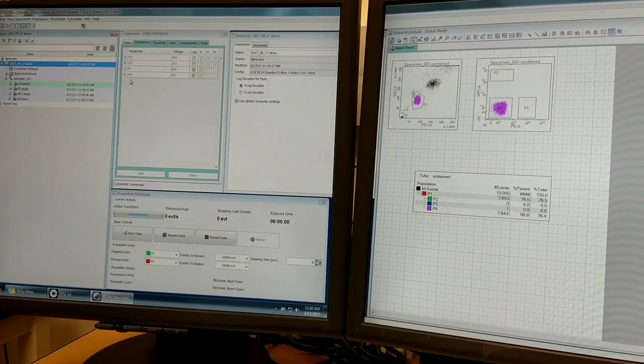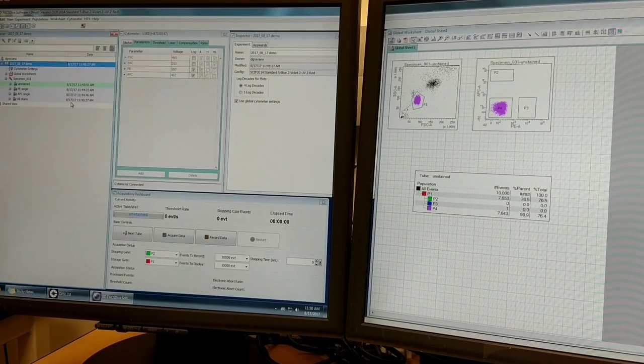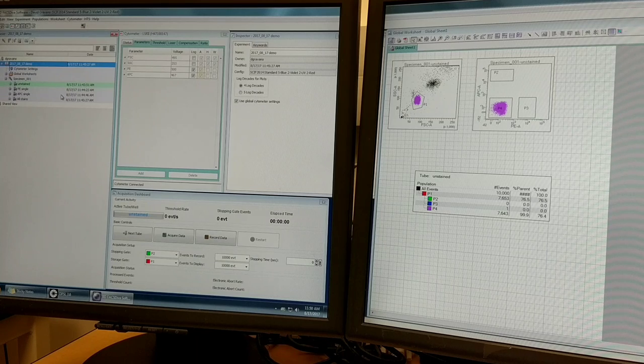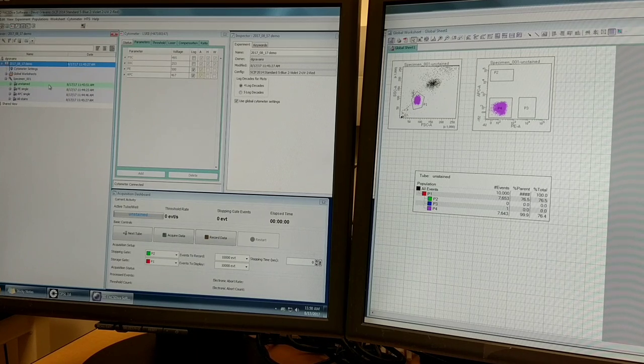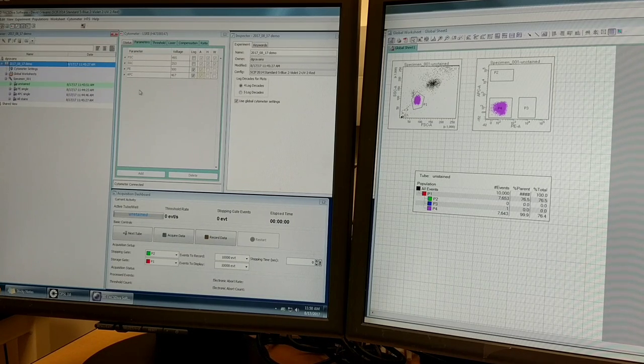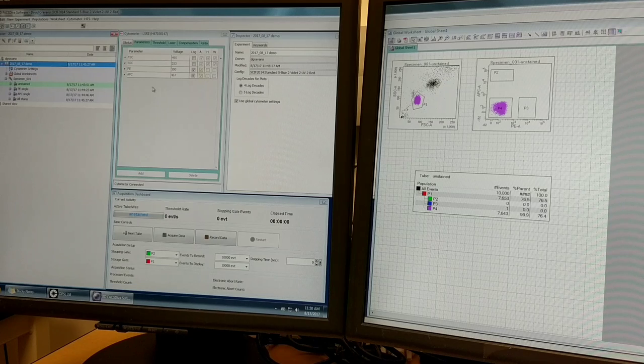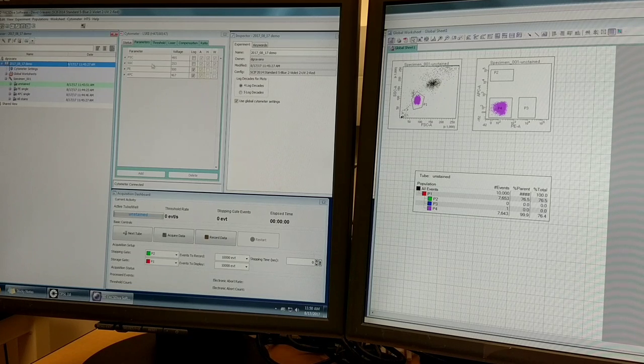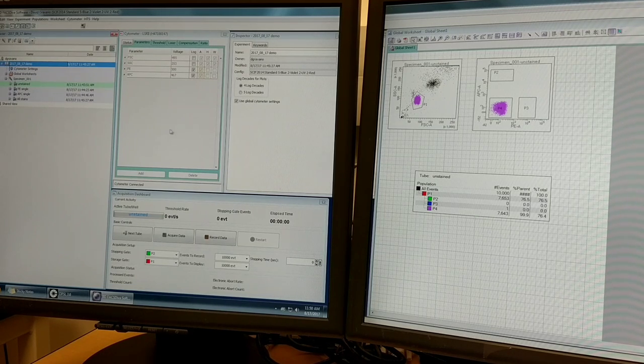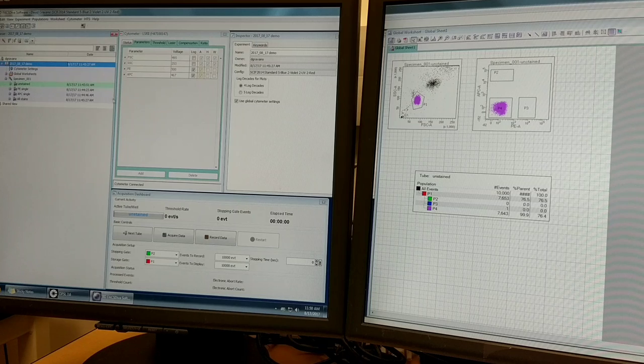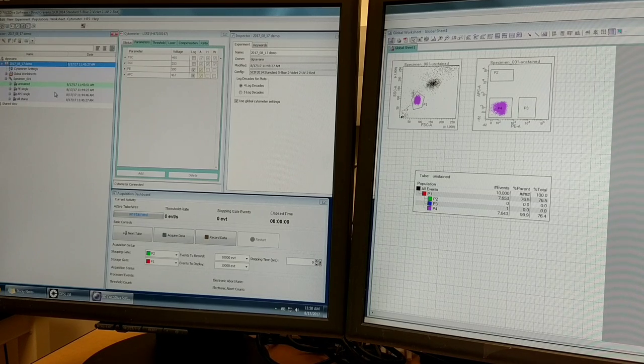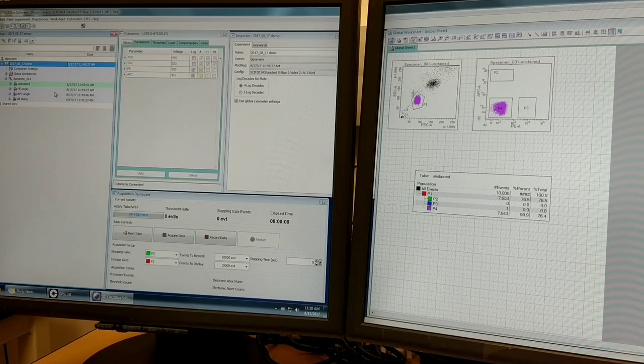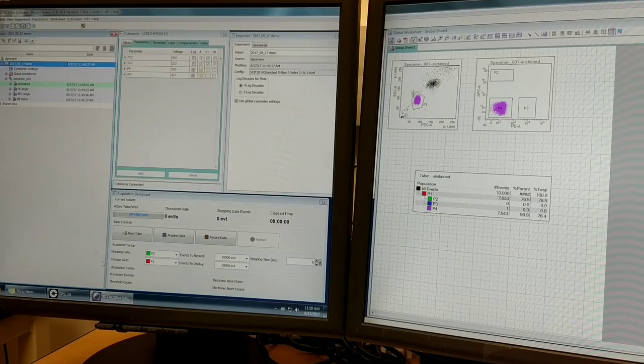So that concludes what I wanted to demonstrate on some basic generation of an experiment, setting up voltage settings and parameters. We did not cover compensation - that is another topic. And we optimized our settings, recorded our data, and exported the data.